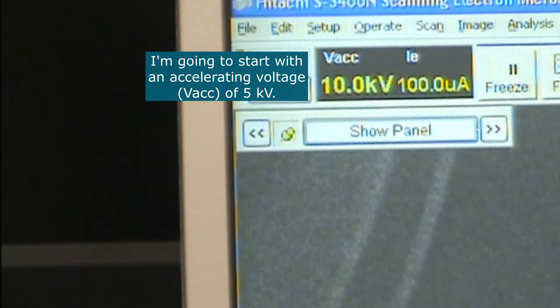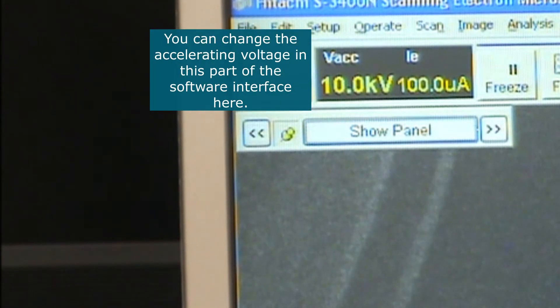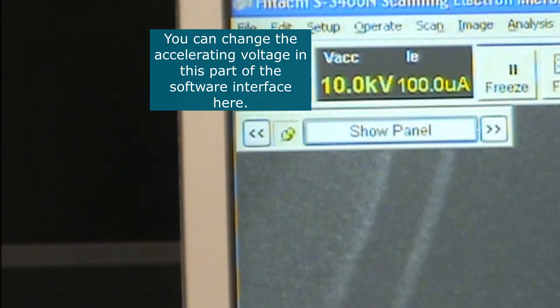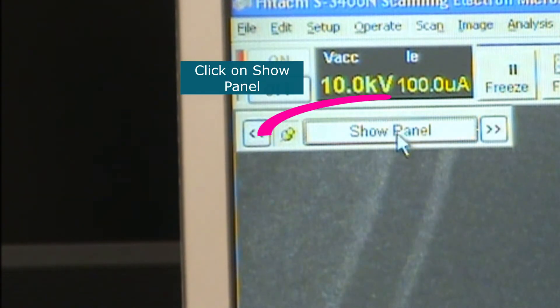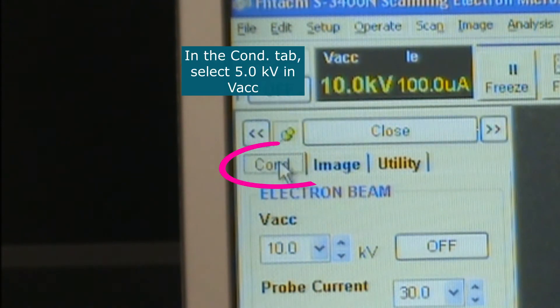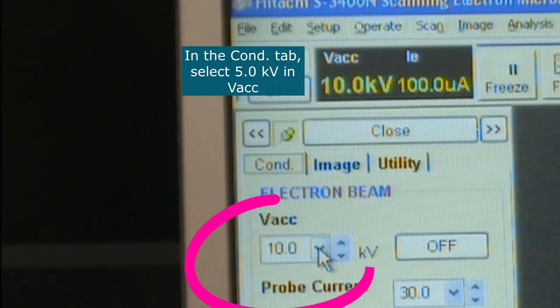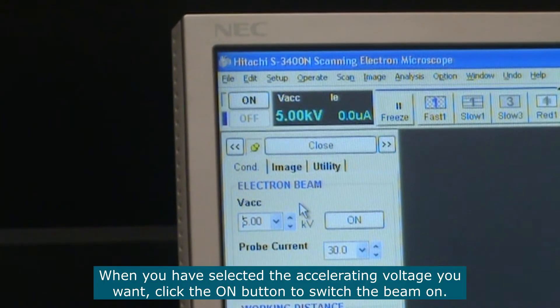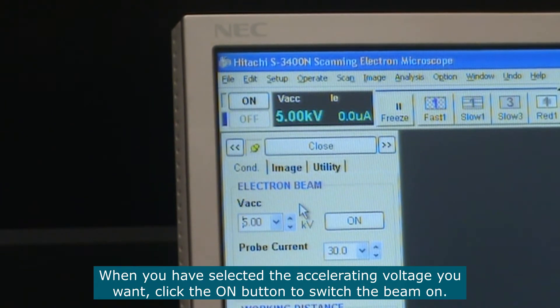I'm going to start with an accelerating voltage of 5 kV. You can change the accelerating voltage in the software interface. Click on 'Show Panel' and go to the 'Conditions' tab, where you can change the accelerating voltage. Select 5. Once you have selected the accelerating voltage you want, click the 'On' button to switch the beam on.